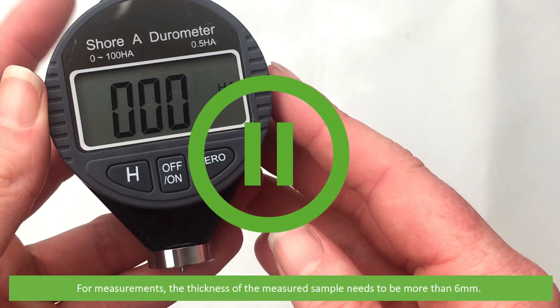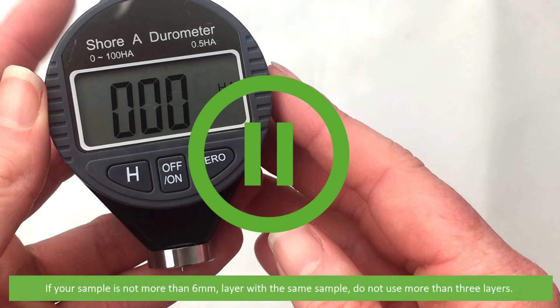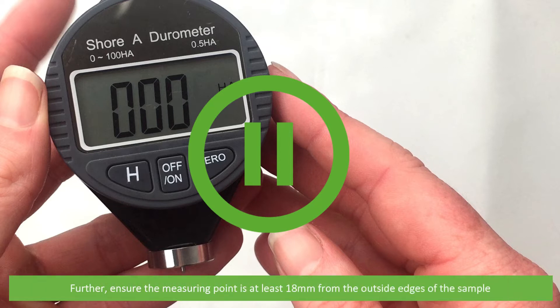For measurements, the thickness of the measured sample needs to be more than six millimeters. If your sample is not more than six millimeters, layer it with the same sample, but do not use more than three layers. Further, ensure the measuring point is at least 18 millimeters from the outside edges of the sample.